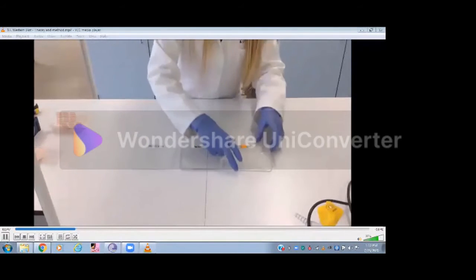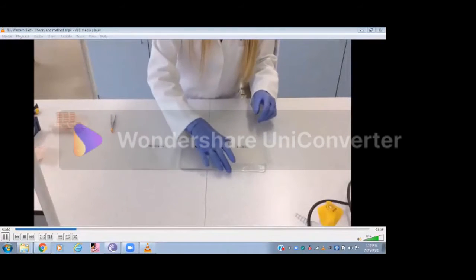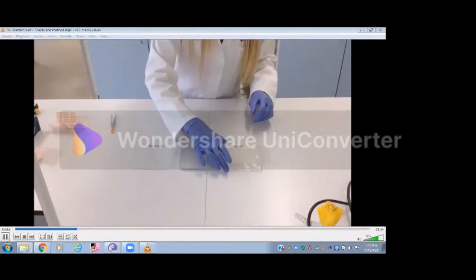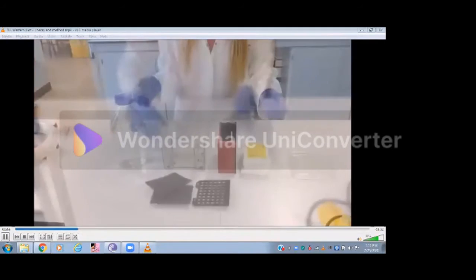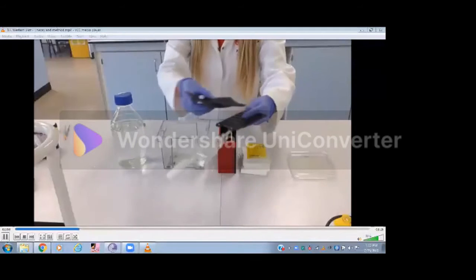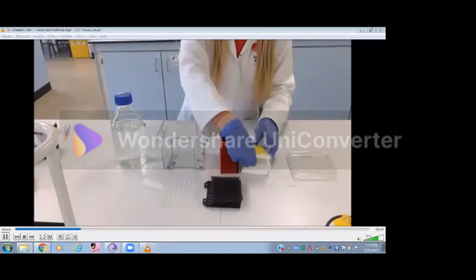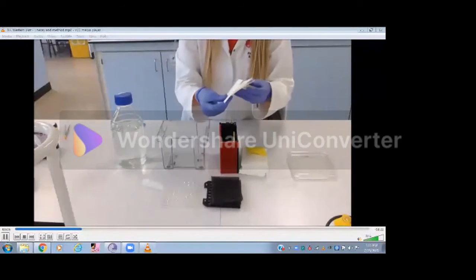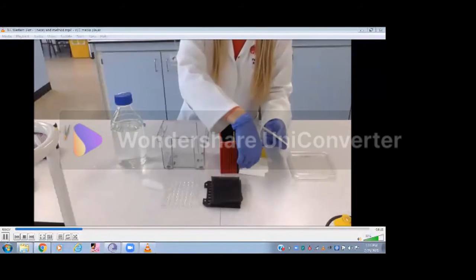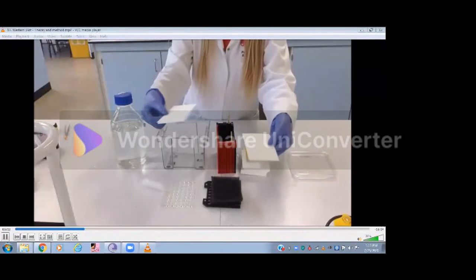After rinsing off the membrane, you can then transfer it into a transfer buffer, and it will sit in here until you're ready to continue the Western blot. So for this next step, you'll need 2 sponges, a blotting cassette, and some blotting paper. Depending on the thickness of your blotting paper, it depends on how much you use. In this video, we are using 2 pieces above and below where we're going to sit the membrane.